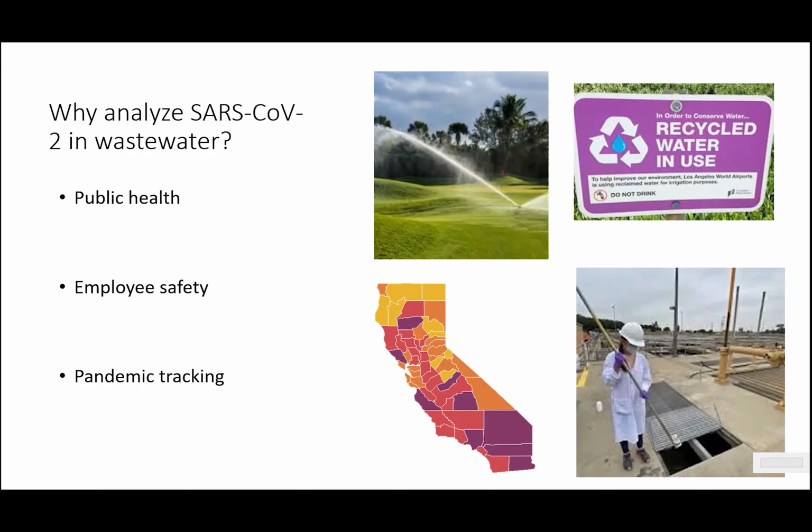And at the time, there was very little data on the amount of SARS-CoV-2 virus in wastewater, and even less data on whether or not it was infectious. And finally, we did recognize that there was potential for us to provide some wastewater surveillance data to help our local public health departments and to get a better picture of the extent of the pandemic in our local communities. And so, knowing the urgency of the situation coupled with both an organizational as well as a public health need, we initiated a project to test for the virus in wastewater matrices.